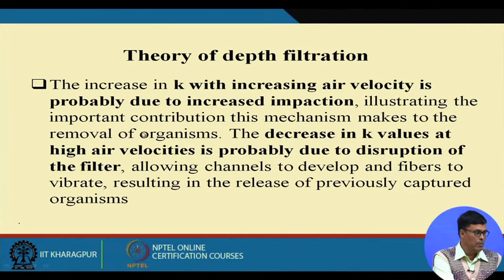Now, the increase of k with the increase of air velocity is probably due to increase of impaction, illustrating the importance of the contribution of the mechanism to the removal of the microorganism. The decrease of k value at the higher velocity is probably due to the disruption of the filter, allowing channels to develop and fibers to vibrate, resulting in the release of previously captured organisms.